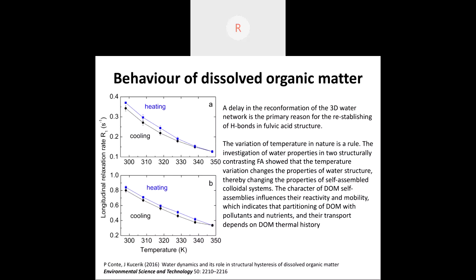So these types of experiments can show how to monitor nutrient dynamics in soils, and eventually how to remediate these problems if we have a thermal excursion, a very high thermal excursion.